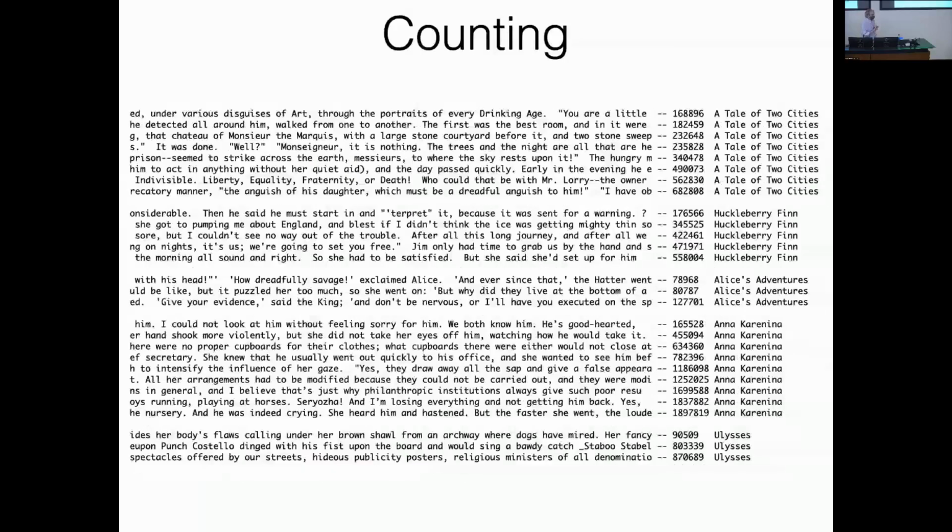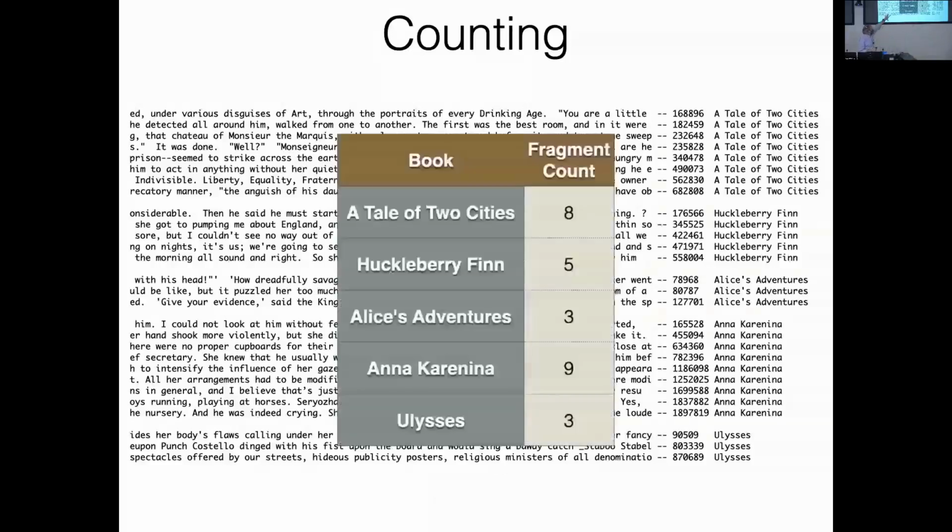We saw this with the library example, right? We just take the reads and we look and see how many, in this case, it's to each book, but you can imagine that instead of going by book or chromosome, you could go by gene. And so for that, to go to genes, you actually need the annotation of saying, okay, this position here in this chromosome is in gene ABCD, right? And so what you end up with is a table where instead of books here, you have genes, right? And so we saw three reads from gene A, 9 reads from gene B.